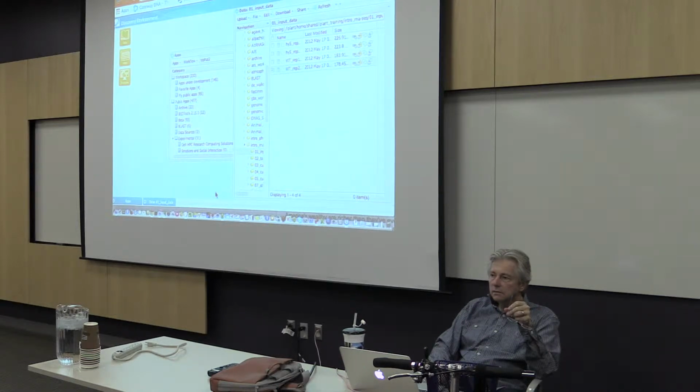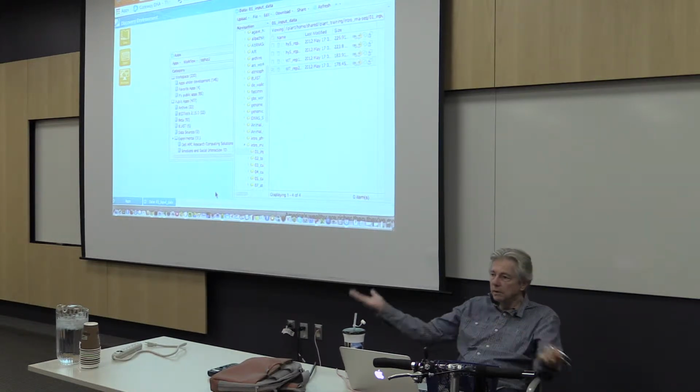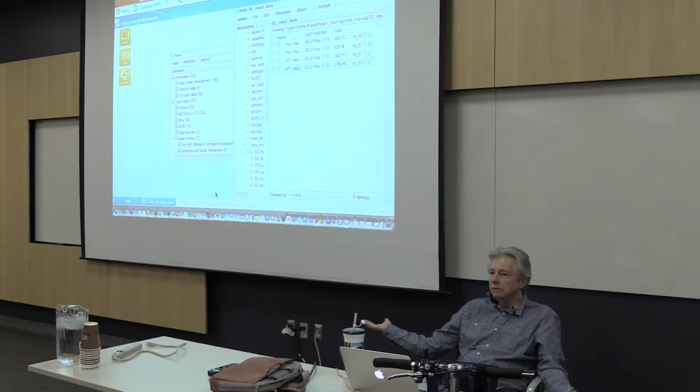Architecture of the genome versus the transcriptome, maybe run the faster analysis. Yeah, and it is, as Eric pointed out. If a lot of your RNA reads include some of those repeats, and some of those repeats may just be trying to map to 10% of the genome, it'll spend a lot of time mapping to all those sites and then comparing them and trying to decide which is the real site.